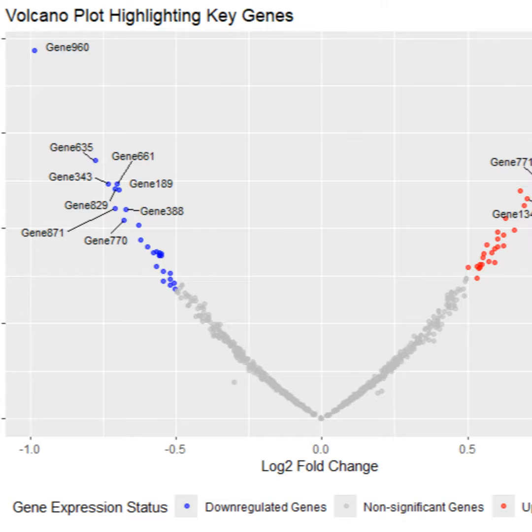Remember how we talked about those overcrowded plots? Well, imagine if you could interact with the plot itself, zooming in and out of different areas, even clicking on specific genes to learn more about them. Wait, interactive volcano plots? That sounds amazing, like a Google Maps for gene data. You got it. These interactive plots can be incredibly powerful for exploring complex data sets. Instead of just seeing the static image, you can actively engage with the data, uncovering patterns and relationships that might not be visible at first glance.